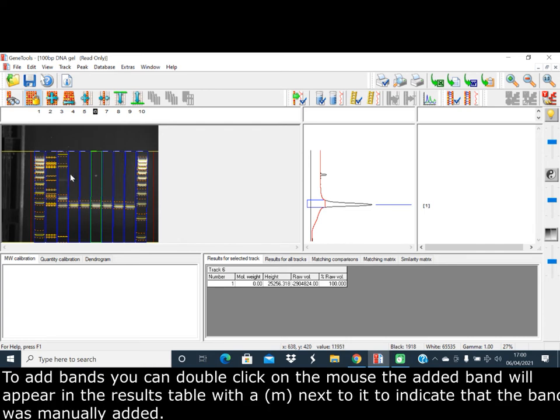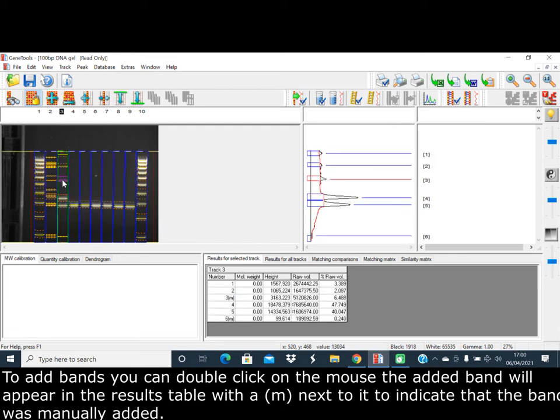To add bands, you can double-click with the mouse. The added band will appear in the results table with an M next to it to indicate that the band was manually added.